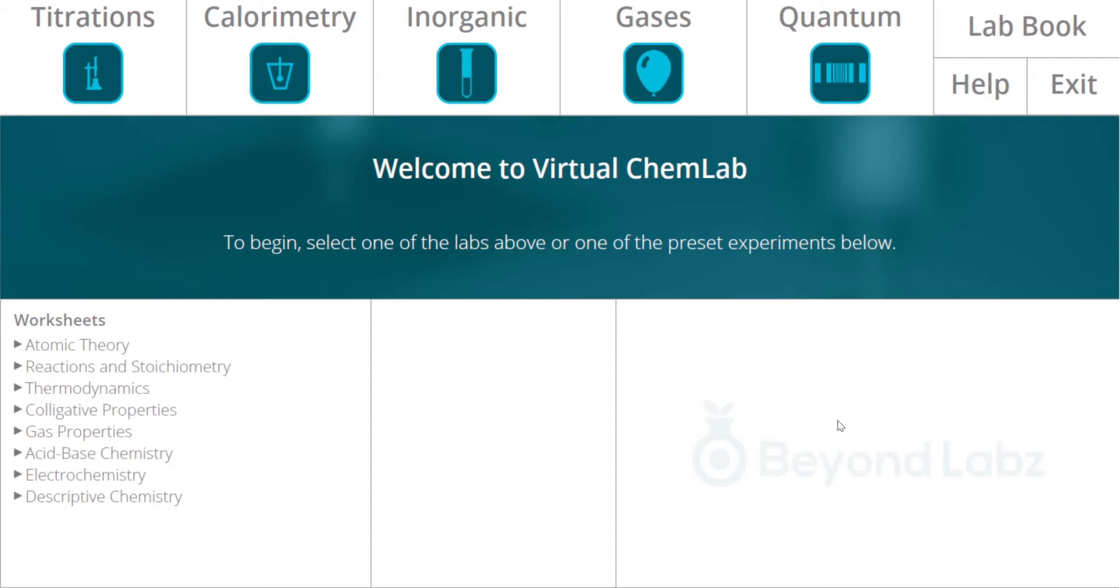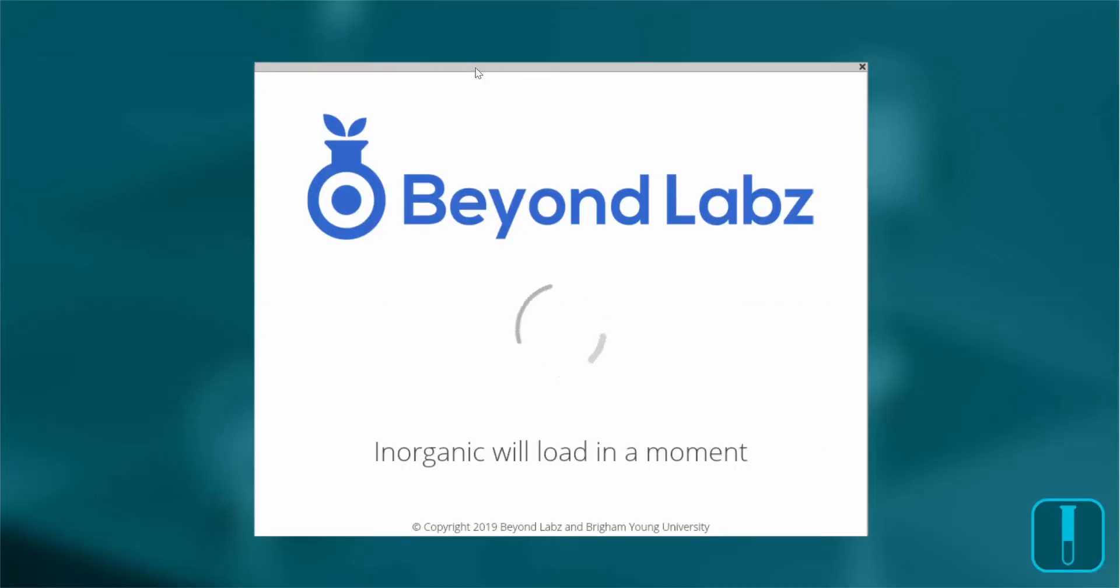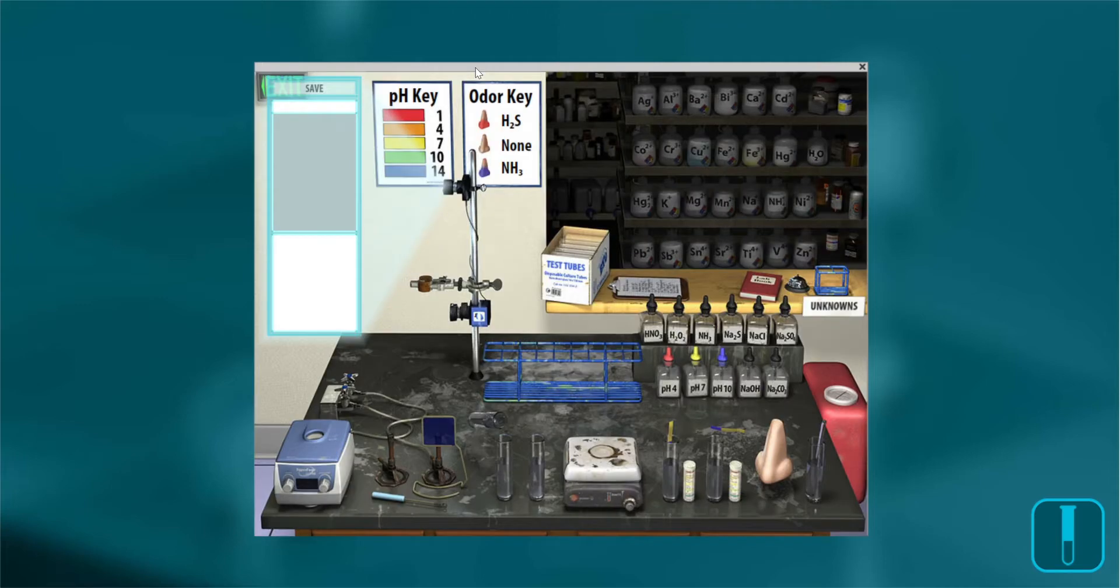In this video I'll walk you through how to perform precipitation reactions in the inorganic laboratory for qualitative analysis experiments. I'll enter through the icon at the top, though you could also enter through a worksheet preset.